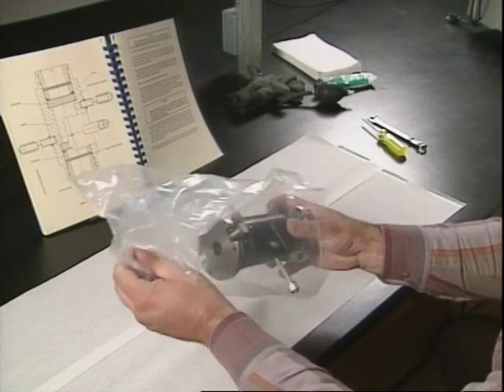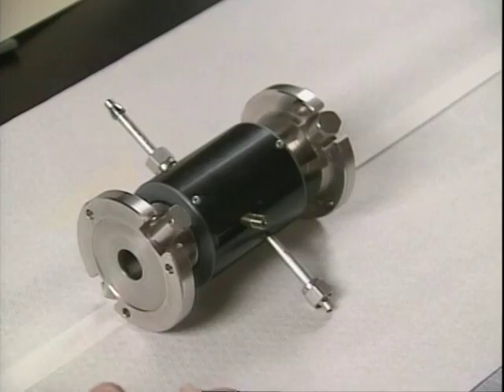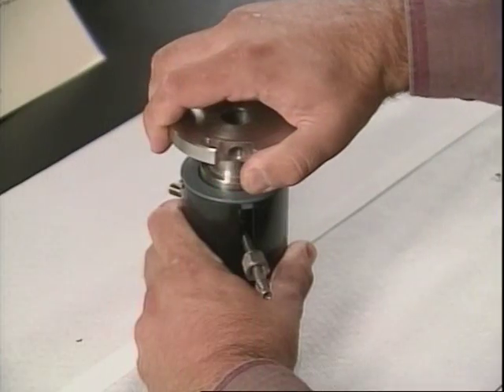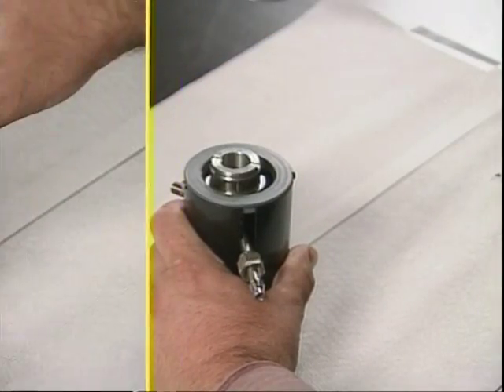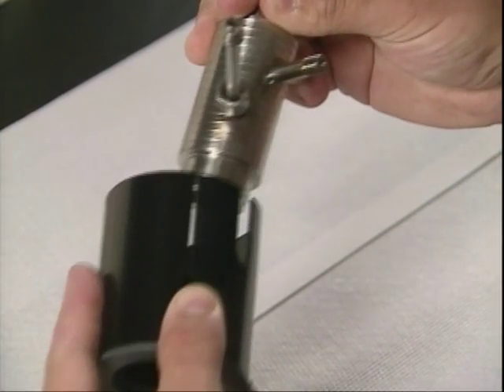Take the entire cell assembly to a clean, dry area where it can be safely dismantled. Remove the gas scrubbers from the flanges and pull the flanges off the cell body. Then remove the protective cover and heating elements if installed.